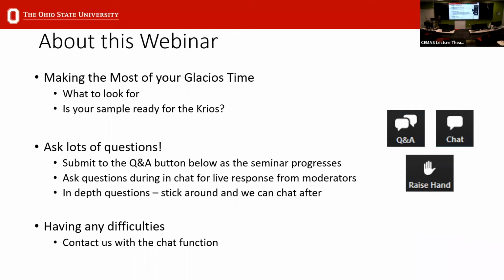The purpose of my talk today: I geared this talk for people who are just starting out in Cryo-EM and just had their initial training session on the Glacios, but are still not sure what exactly they're supposed to be looking for. Hopefully by the end, Cryo-EM users will have a better idea of what to look for and how to effectively screen their samples on the Glacios. And being effective on the Glacios will help you down the road when it's time to collect data on the Krios and for your Cryo-EM data processing.